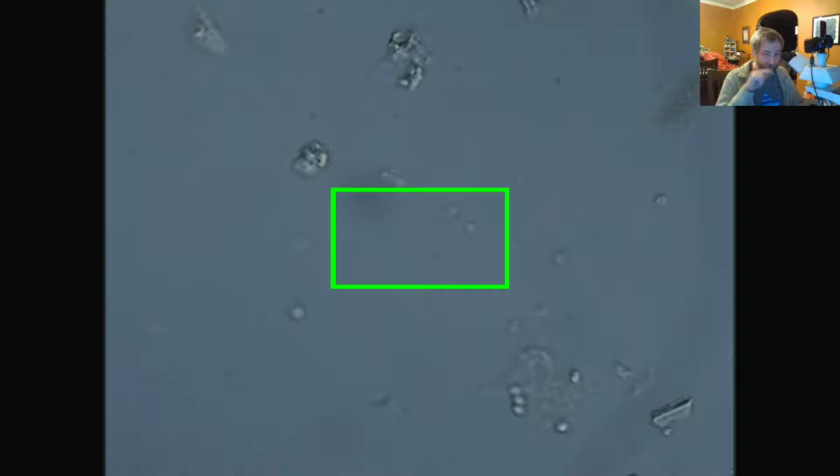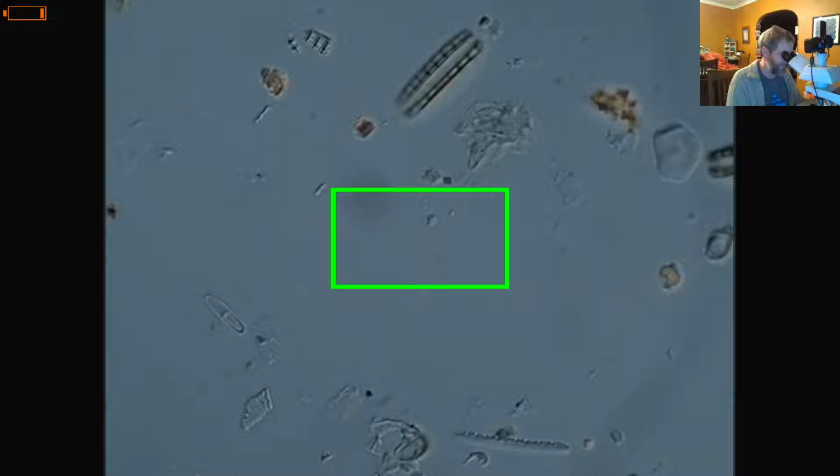And then I also noticed that I was looking at unprocessed material when I normally process them, and that actually limited my views that I wanted to see. So earlier tonight, I had my undergrad student in the channel, Rihanna, and before the stream, she had been in the lab and added nitric acid to the samples. So tomorrow I'm gonna have to rinse out the nitric acid.